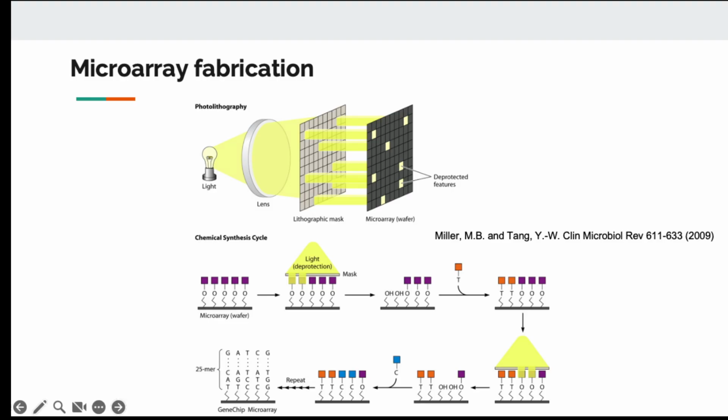For example, we might try to synthesize the oligonucleotide on each cell using reaction, and we control the reaction so that we add A, T, C, or G on specific cells, maybe with a filter, so that when we shine the light to activate the polymerization reaction, a filter says, I only want A to be incorporated in certain cells, and we filter out the other cells.